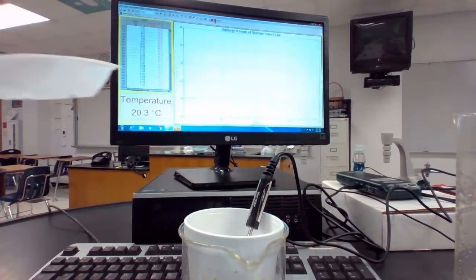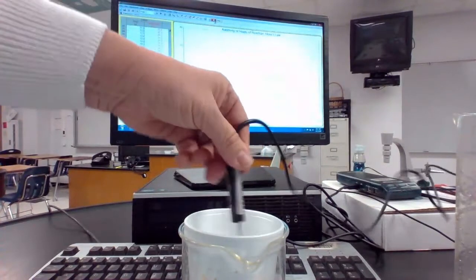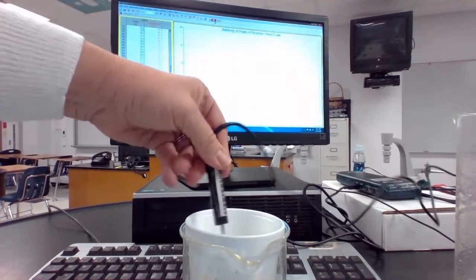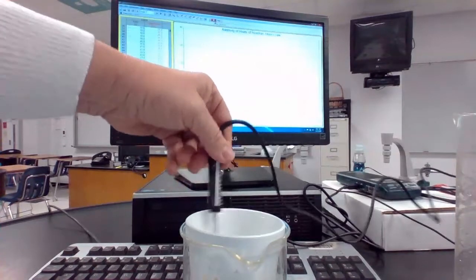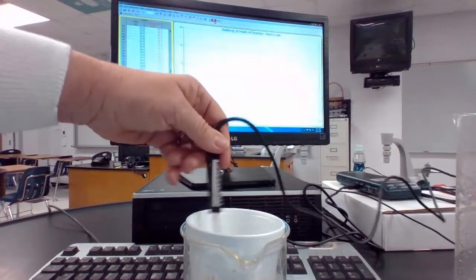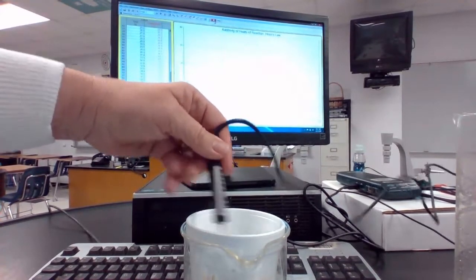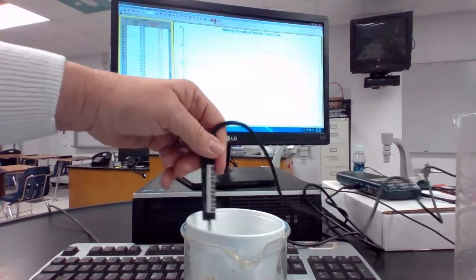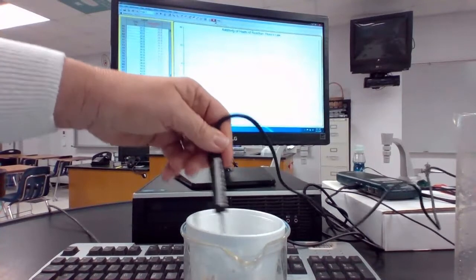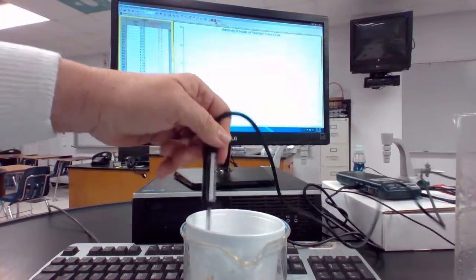So I'm going to go ahead and add that in to my liquid, and I'm going to use my thermometer probe to stir, and I'm going to stir and stir and stir while this thing is beginning to react, and we're going to keep stirring and keep letting it react until we get all the way to the end of the reaction. And what I'm doing is I'm simply dissolving the sodium hydroxide into the water, and that is going to give us the result here. So here we go.